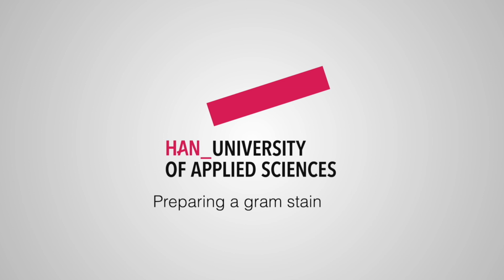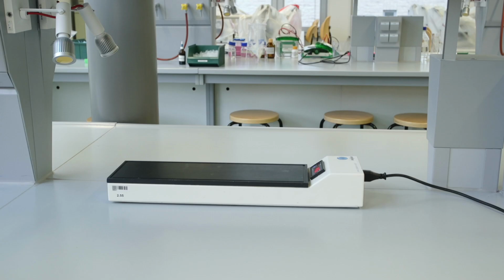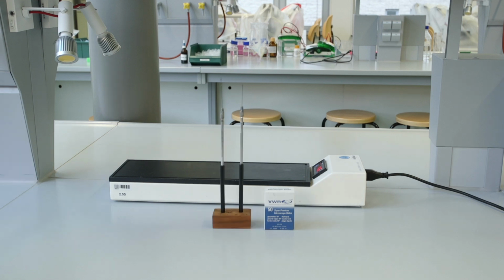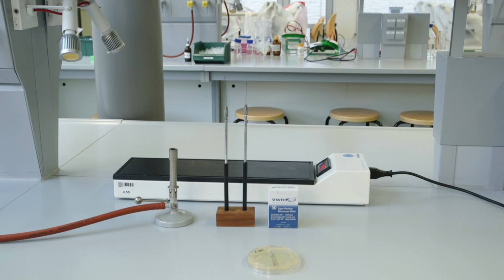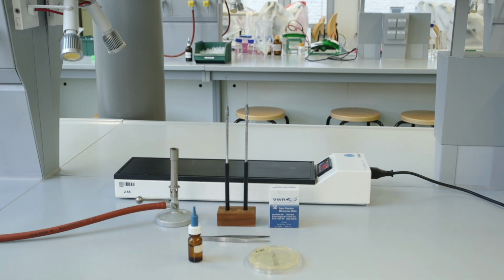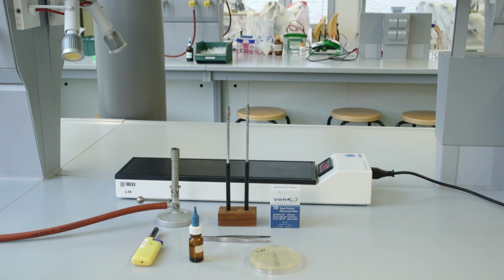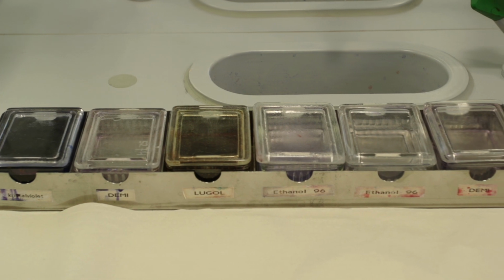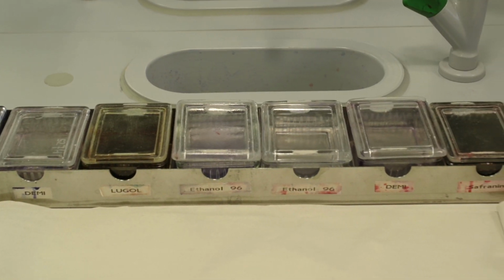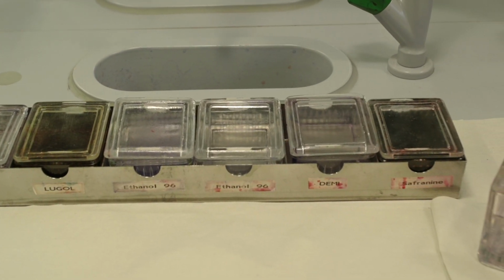Preparing a gram stain. For this experiment you will need a slide dryer, an object slide, 2 inoculation loops, a Bunsen burner, a bacterial culture, tweezers, a squeezy bottle with saline, and a lighter. Make sure you have filled a colour series already and check that the demi-water is clean. If necessary, you will have to refresh the demi-water before you start the staining.